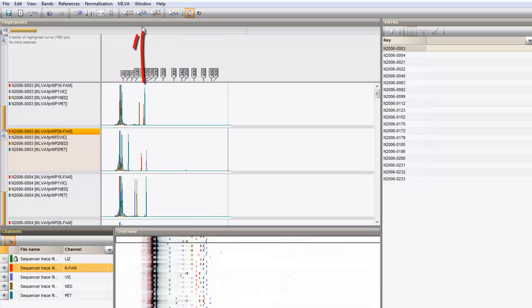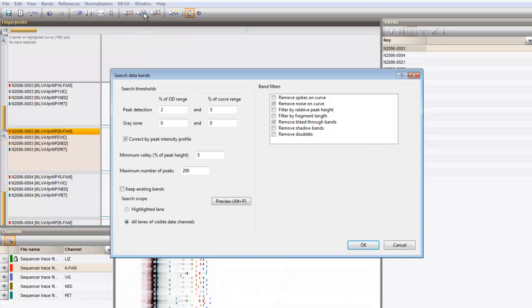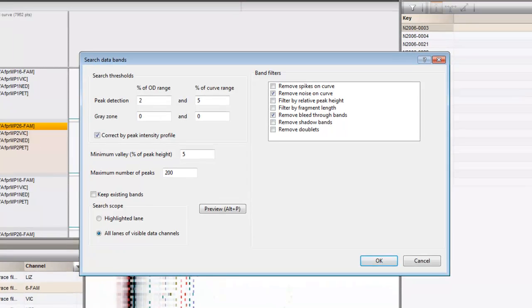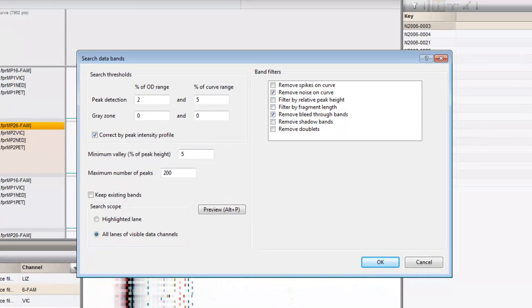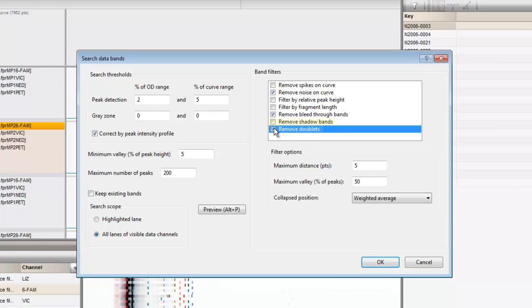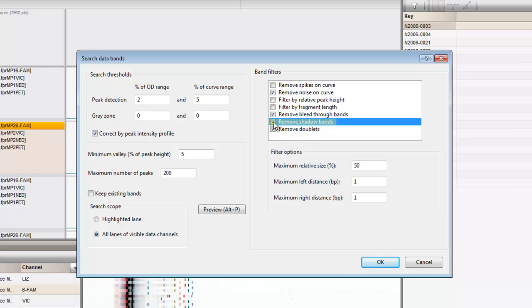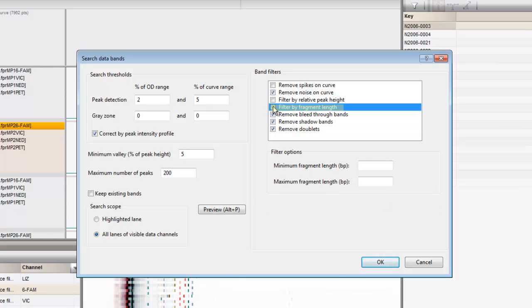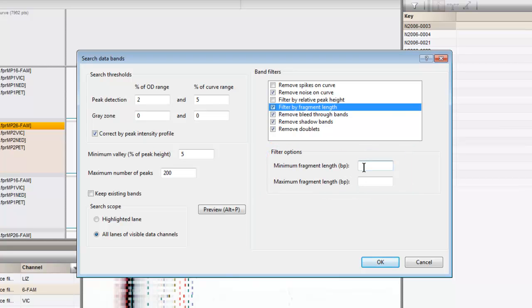Press Search Data Bands. Here I check Remove Doublets, Remove Shadow Bands and I will filter by fragment length. I specify a minimum length of 50 and press OK.